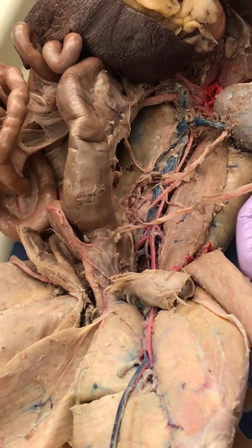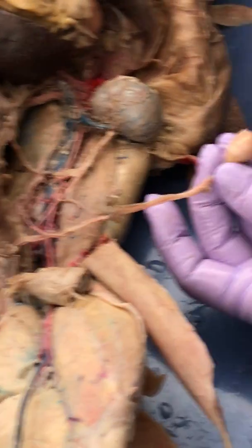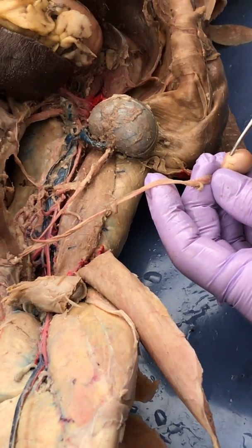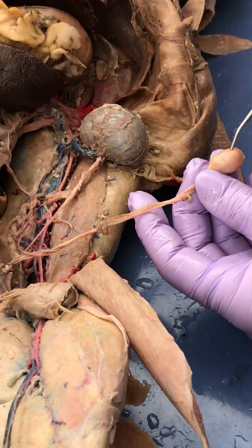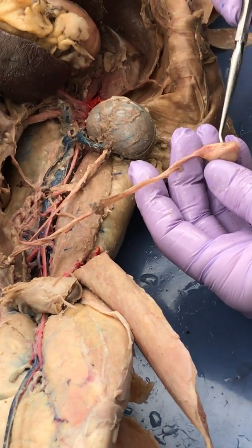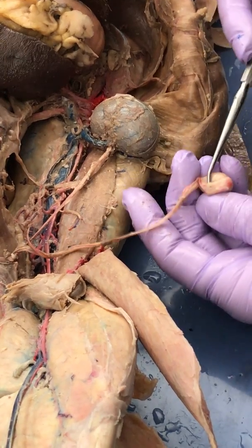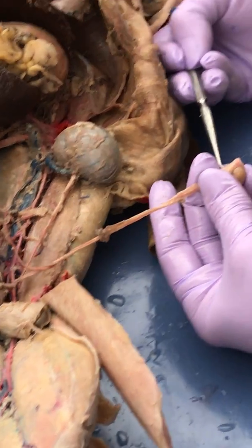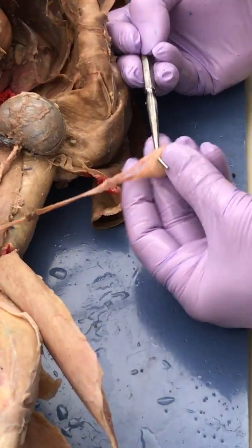Okay, so we had a male. Just saw this laying here, so I figure, well, might as well do something with that. What's this? Testis. Okay, and then the testis has this thing, epididymis. Yeah, could almost make it through. Let me see if I can. I think we did the other one. Hold on, that's already done. Use right there. Testis. Yep.